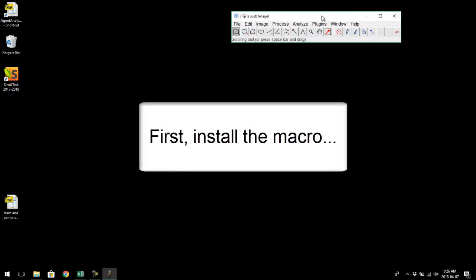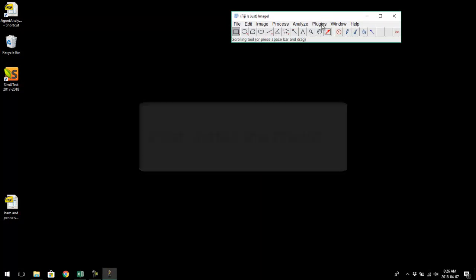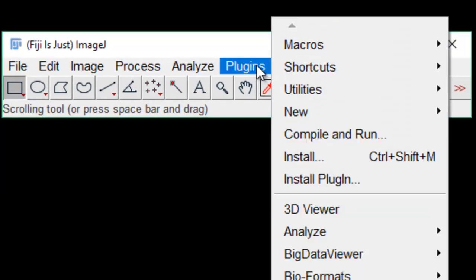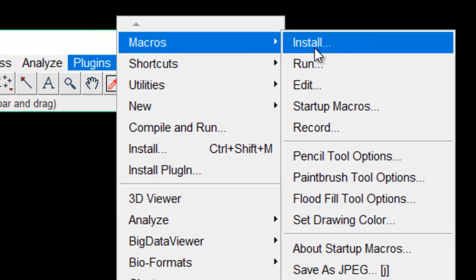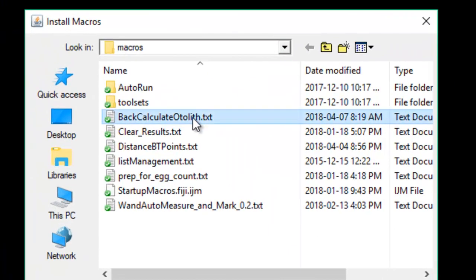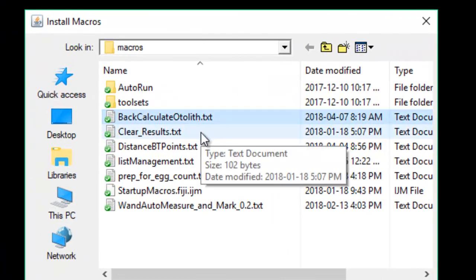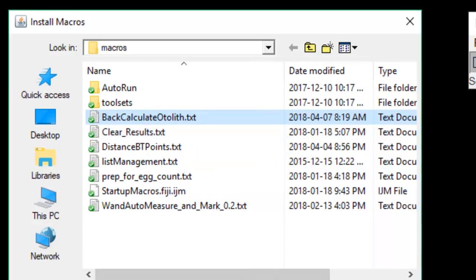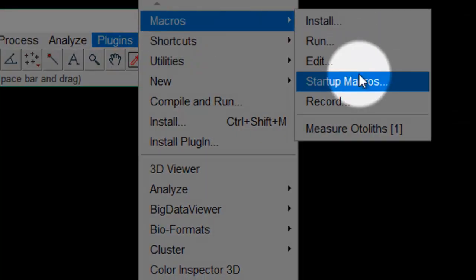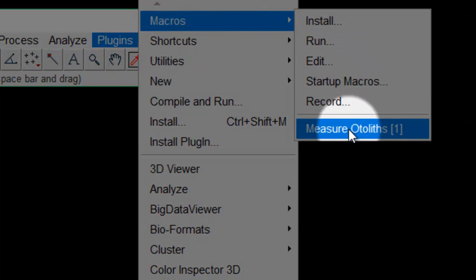The first thing we need to do is install the macro. The easiest way to do that is go to Plugins, Macros, Install. Then browse for wherever you saved the macro as a text file. I saved it and named it backcalculateotolith.txt. You'll then see it says one macro installed, and you can go to Plugins, Macros, and see MeasureOtoliths is now available.